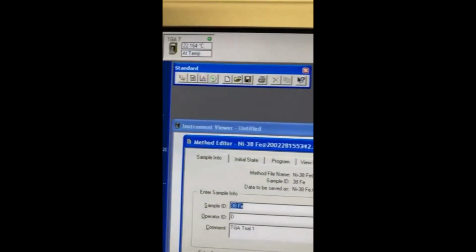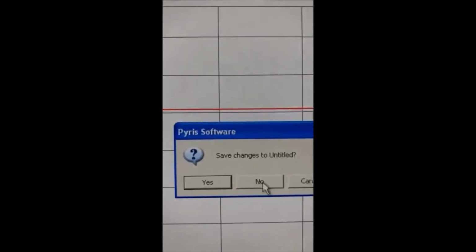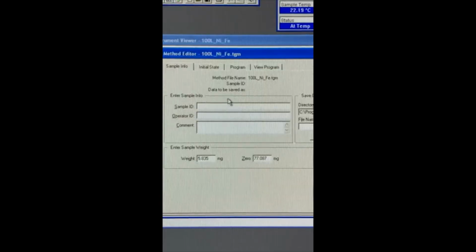This may include the start and end temperature of the profile, the heating and cooling rates of the profile, and any dwell or isothermal holds during the heating profile. The sample information is input into this interface, a file name defined for the saved data, along with a file storage path where the saved data will be located.